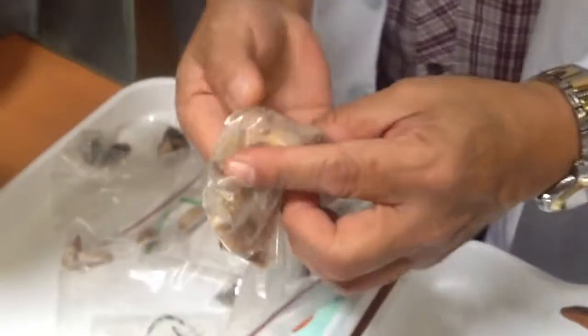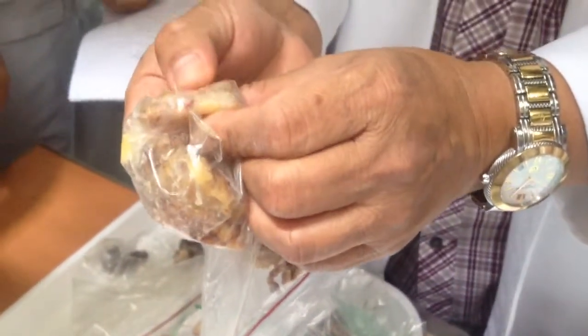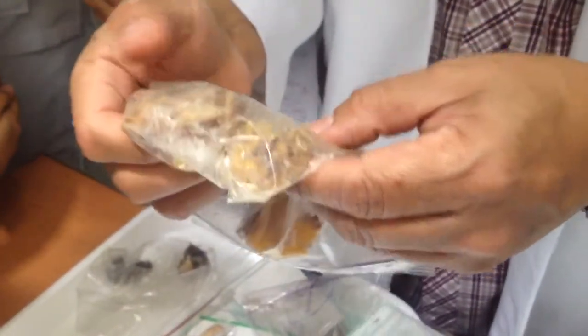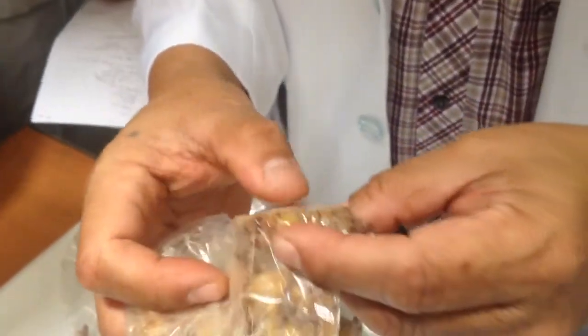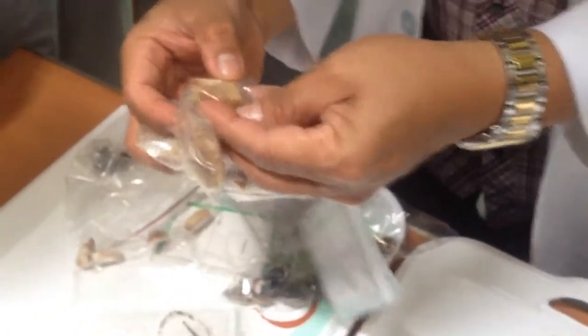So even in this view, notice that it is translucent, myxoid. So it is soft theoretically, but this is hardened already by the formalin. So it is irregular. That portion is gelatin-like. That clear portion is mucin or gelatin-like.